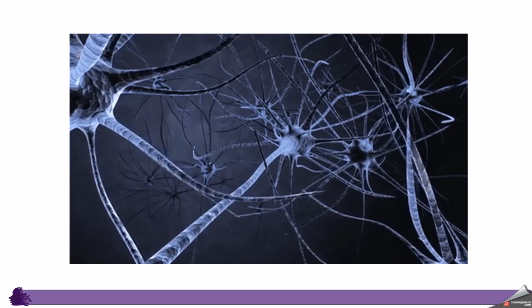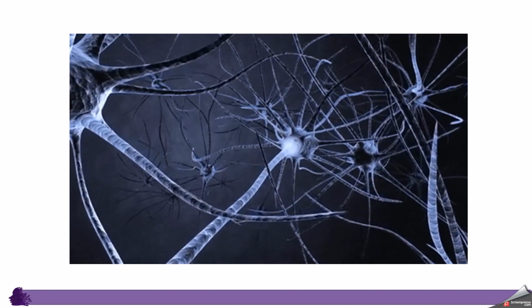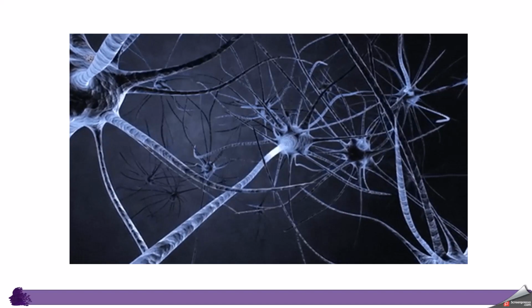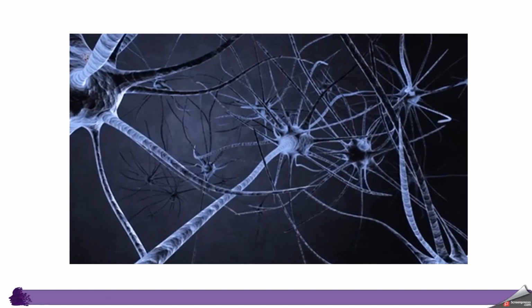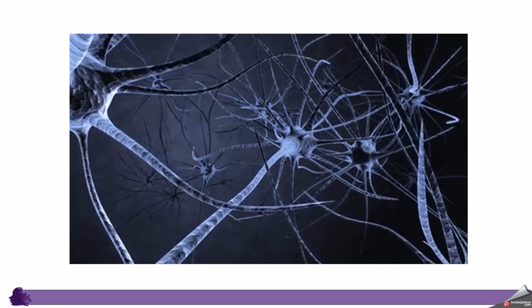PC12 has an embryonic origin from the neural crest that has a mixture of the neuroblastic cells and eosinophilic cells. PC12 cell shapes are round to ovoid and have numerous microvilli and small blebs. In this project, our motivation is to develop an algorithm that can automatically detect PC12 cell counts, branch counts, and length of all branches connected to a single cell.